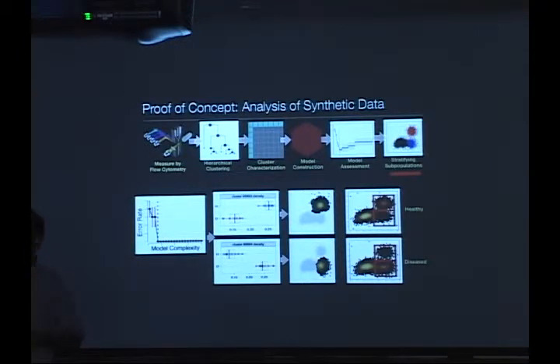You have a bunch of patients that respond to chemotherapy. You have a bunch of patients that don't respond to chemotherapy. That's your finding. You want to know what's different between them. This isn't designed to discover subtypes within a particular set of measured samples. It's only designed to test for specific hypotheses that you have based on external information. Does that get at your question?